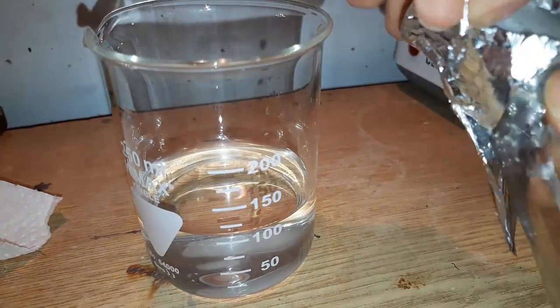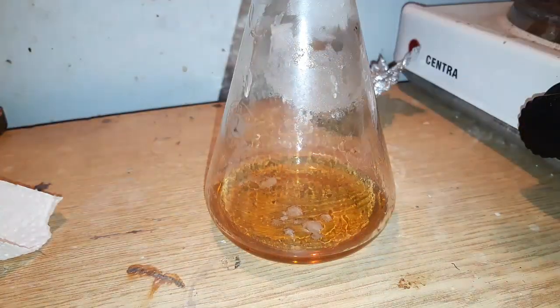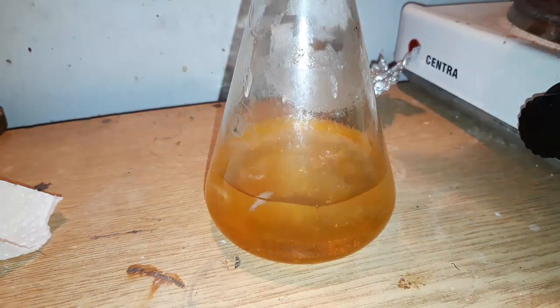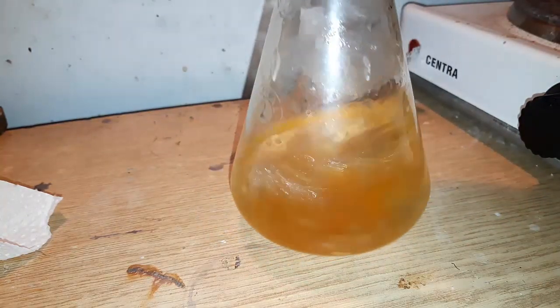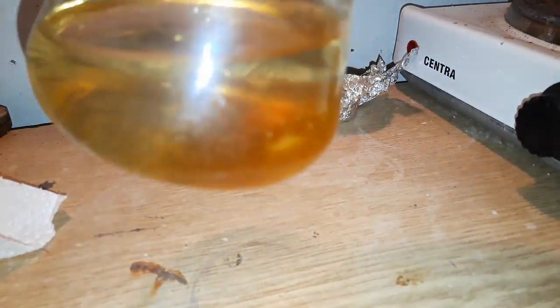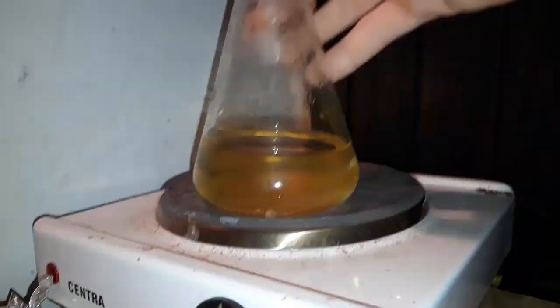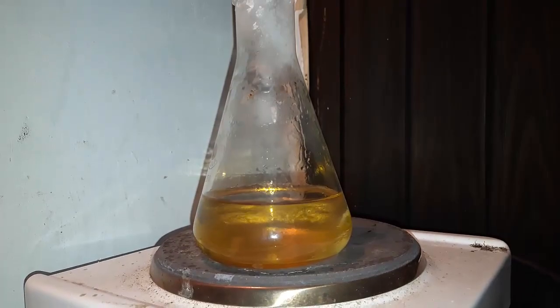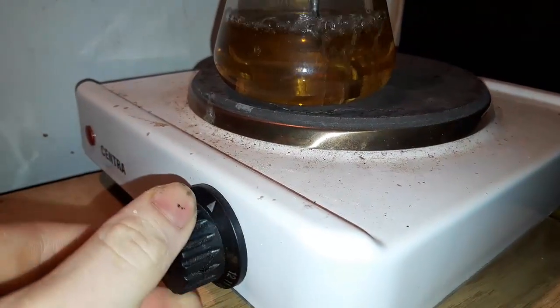Next, we make a solution of 100 milliliters of water and 4 milliliters of 25% ammonia. We add it to our flask, set up for heating again, and boil the contents for five minutes, then cool everything down again.